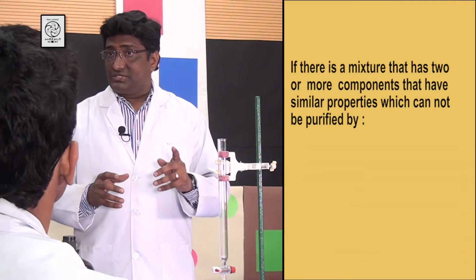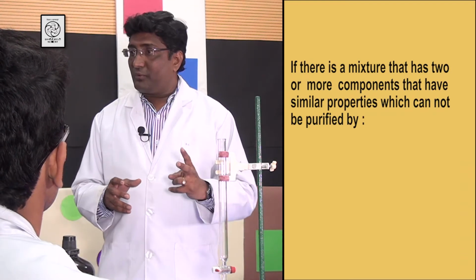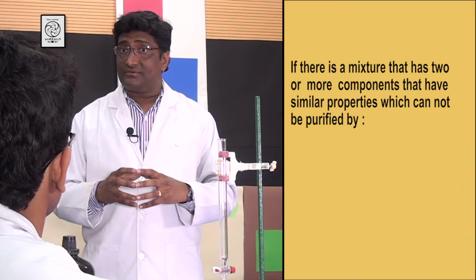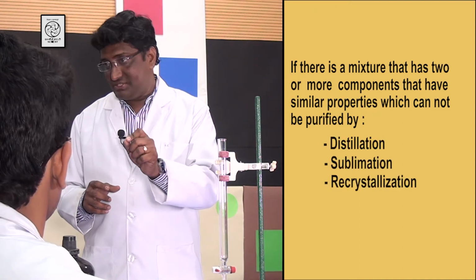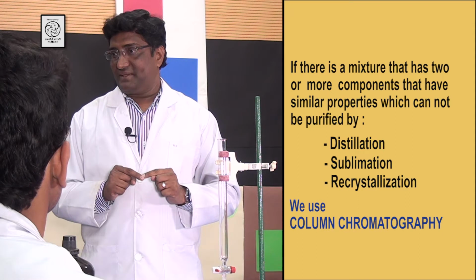Before I start this technique, let me ask you whether you know any separation techniques? Yes, sir. Distillation. Sublimation, recrystallization. Good. If there is a mixture that has two or more components that have similar properties which cannot be purified by the separation techniques that you mentioned, we use column chromatography.